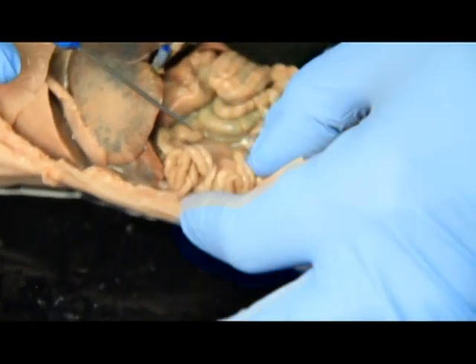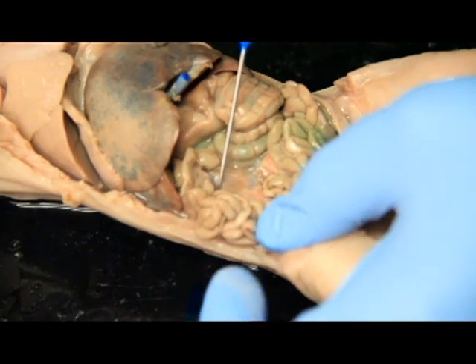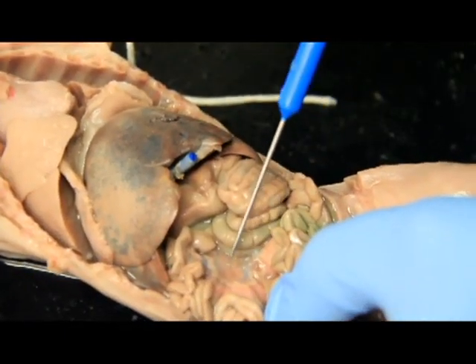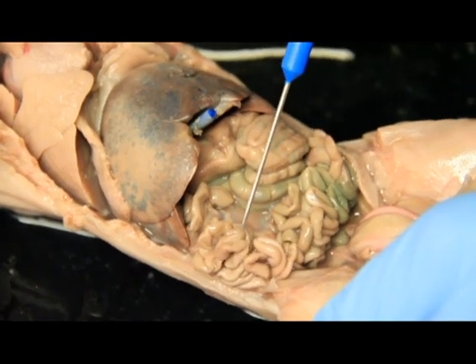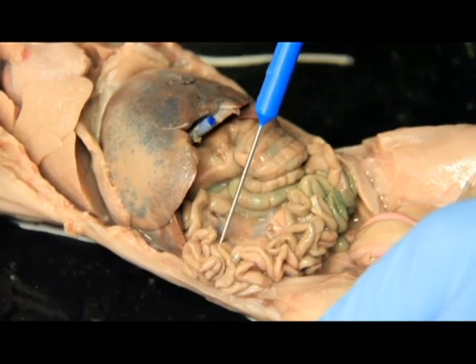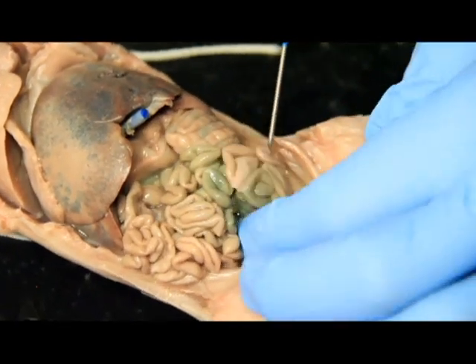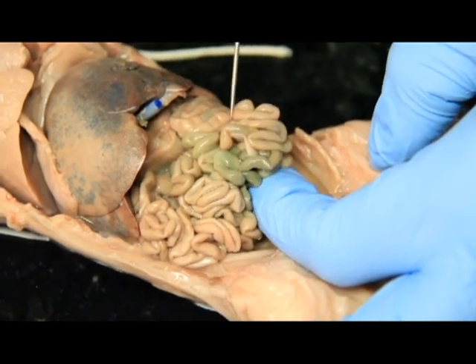So if we spread this out, what we see is all this connective tissue that I was talking about. This is all that mesentery. These are all the mesenteric arteries and the mesenteric veins. And all this connective webbing right here, that is all mesentery. Which means this on the outside, this intestine-looking thing right here, this is our jejunum, because our jejunum has all of this mesentery connecting it right there. Then if we work our way over to the right, you can see this appears to be its own little part that kind of falls off by itself right here.